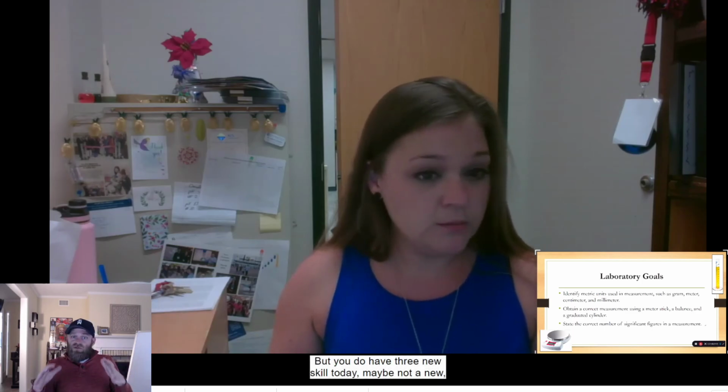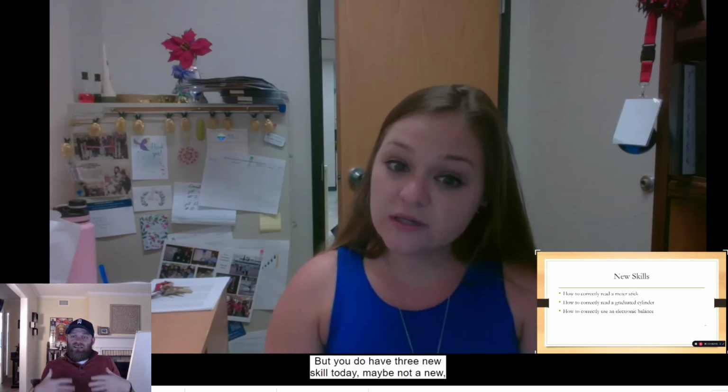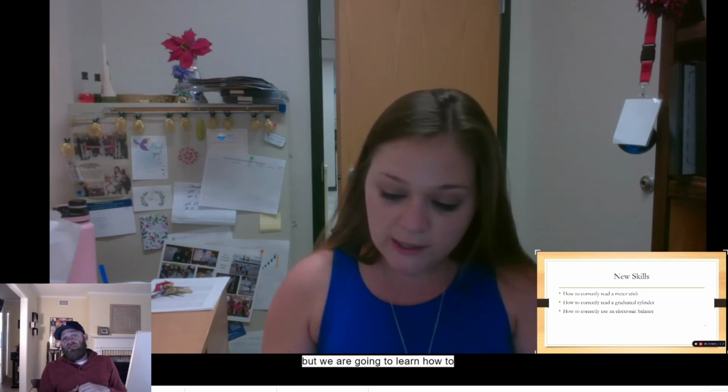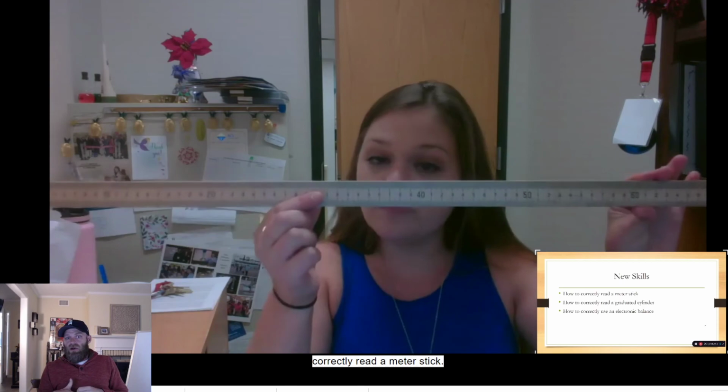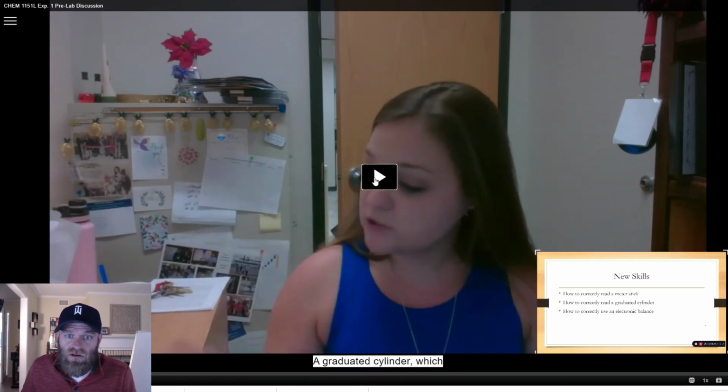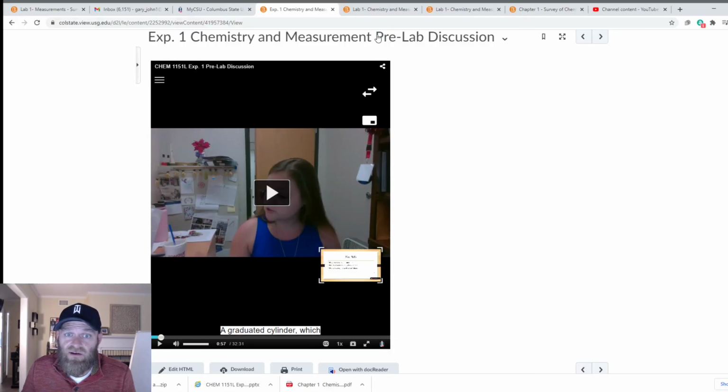And then she'll go through and talk about all the prefixes, why we're using it this way, and what you're necessarily going to do. We are going to learn how to correctly read a meter stick. I never use inches in chemistry. I'll stop that. Y'all take a look at that. Let me know that you can see everything there, right?